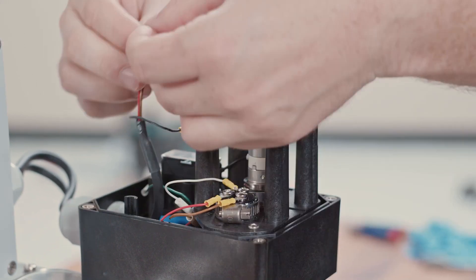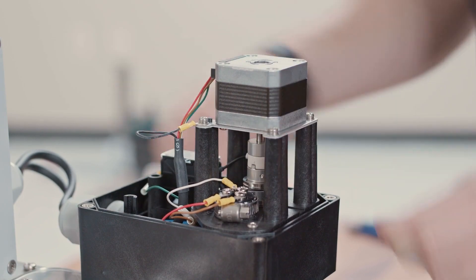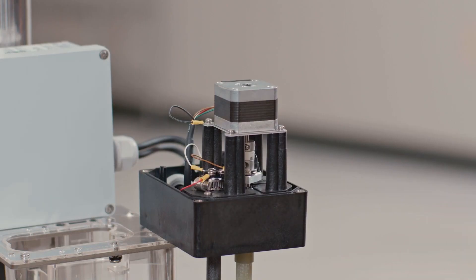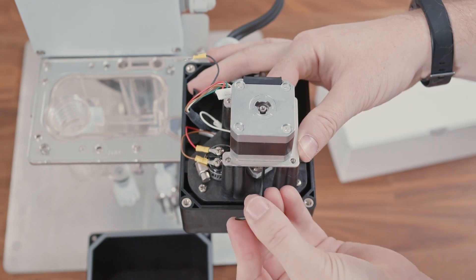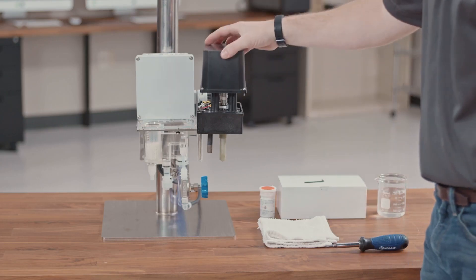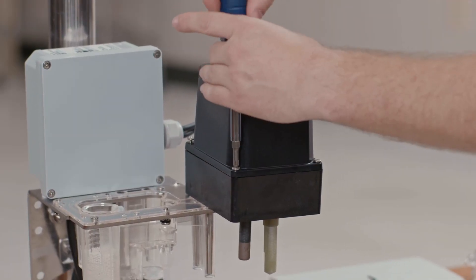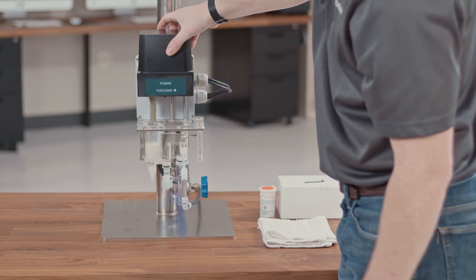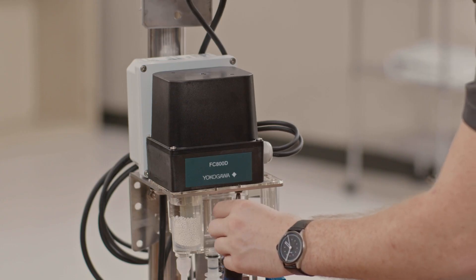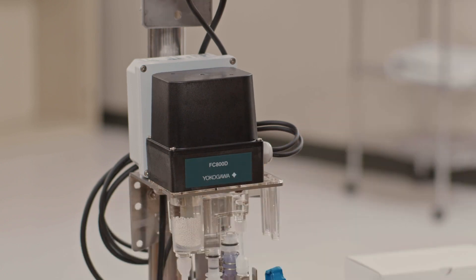At this point you can reconnect the connector to the motor. We can now tighten the coupling allen grooves back together, making sure that the coupler is firmly attached. You can then reassemble the motor cover and put the analyzer back into measurement position. Perform a calibration and the analyzer is ready to measure.